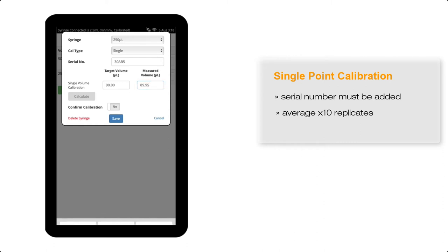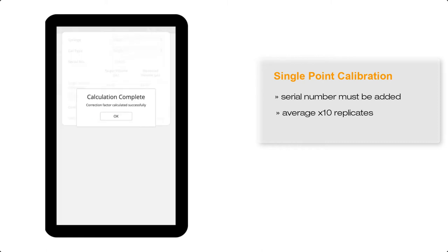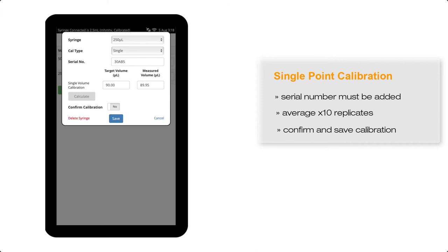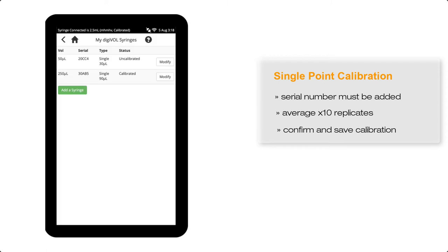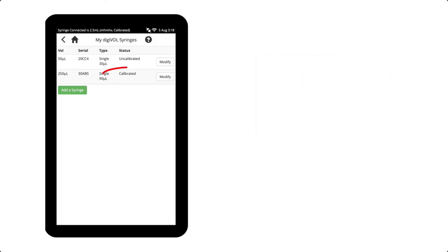The Calculate button now turns green and is active, and selecting this will calculate the correction factor. I'll confirm the calibration and select Save.